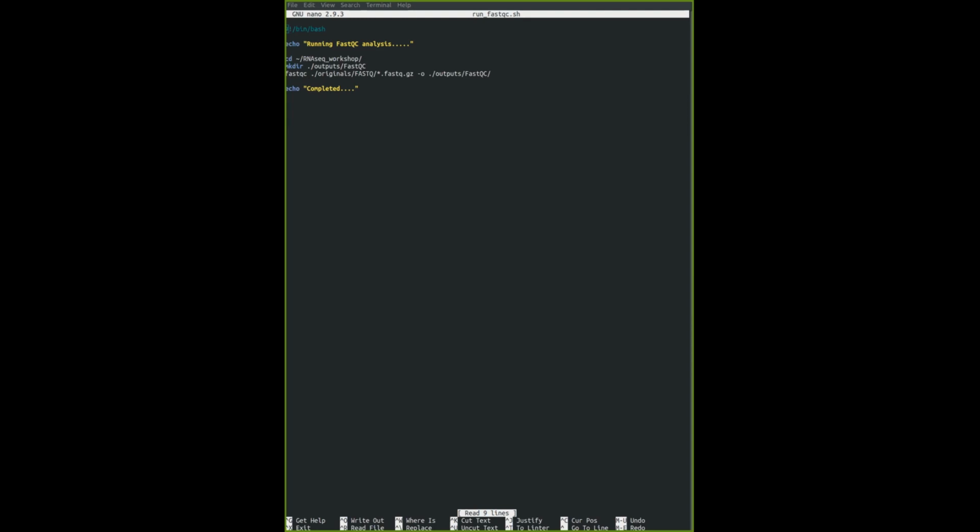How can I edit something that's already written? Because I can't seem to edit what is already written. Do you have the same sort of view as mine? In Nano? Okay, so to edit, you can just bring your cursor down, and if you want to delete the whole thing, just press backspace and delete the whole thing, and like any editor, you will clear out the whole screen. I'm pretty sure there's a shortcut for this, but it's the easiest way to delete the contents.